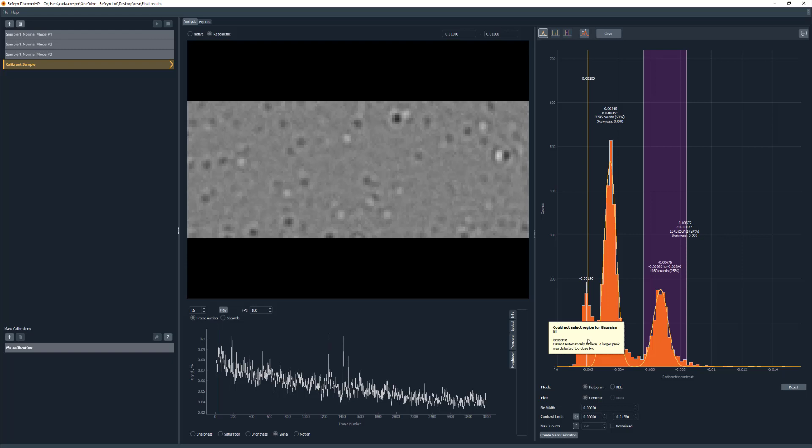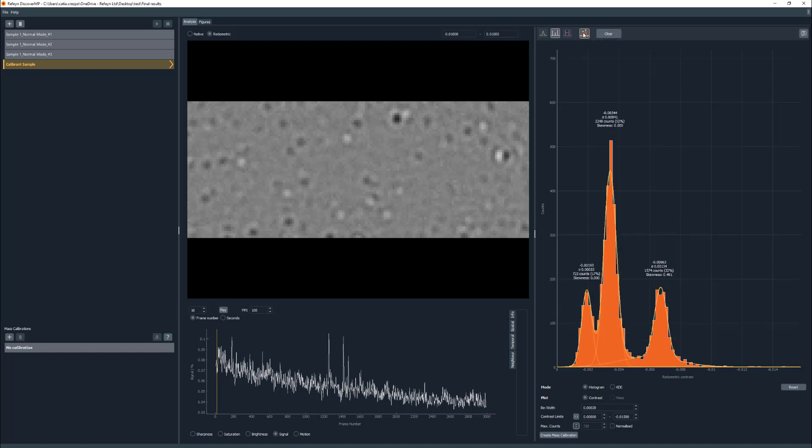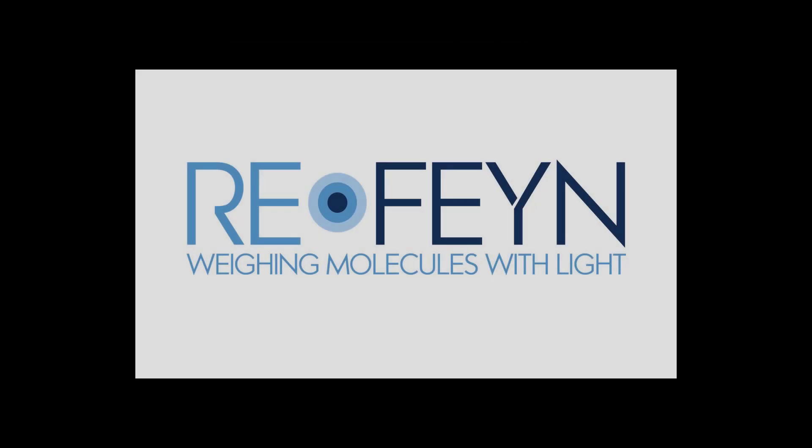If a Gaussian fit has not worked, a small box will appear telling you why the fit was not possible. Lastly, it is possible to recover the automated peak fitting by selecting the last icon on the toolbar.